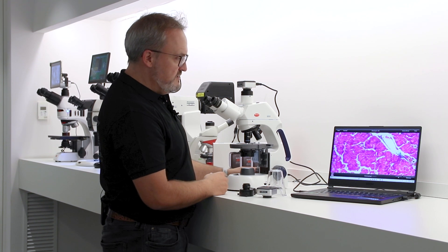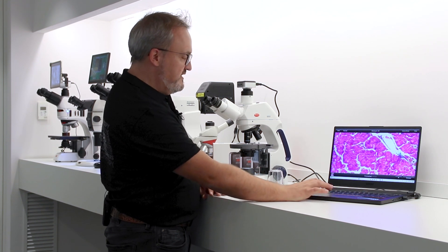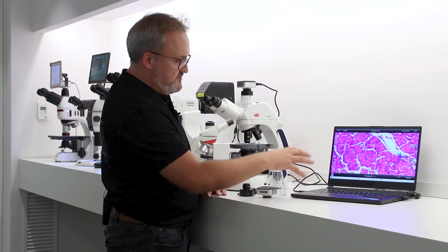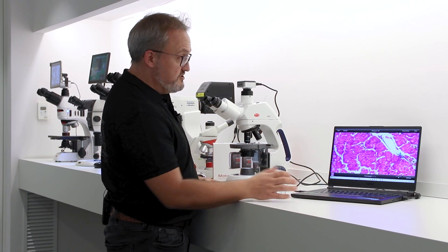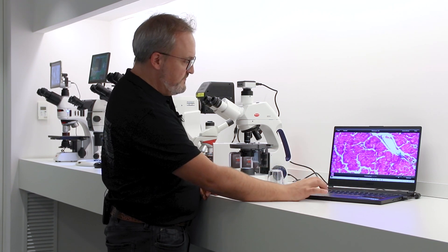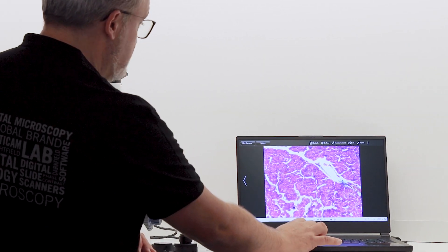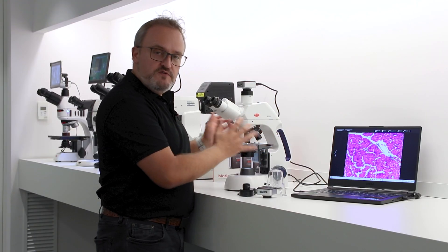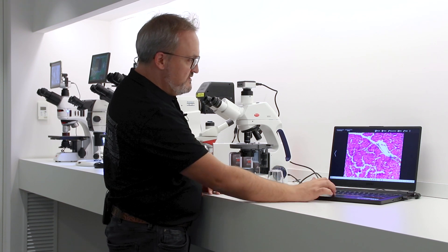What I can then do is after I have selected the image that I would like to capture, when I capture the image it automatically generates a high resolution still image on the computer. So now the image has been taken, I no longer need to focus on the microscope. I now can focus on learning from the image.